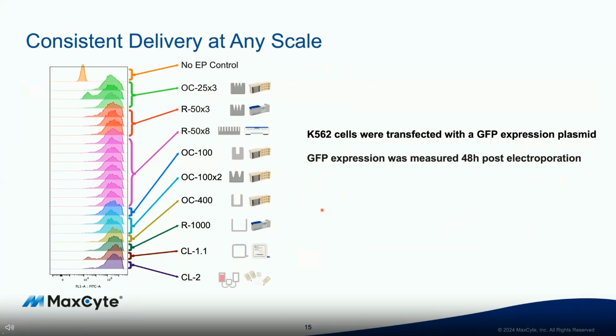Basically, you can use the same cell density, DNA concentration, like I mentioned, and the same electroporation protocol from small to large scale to get the same efficiency.